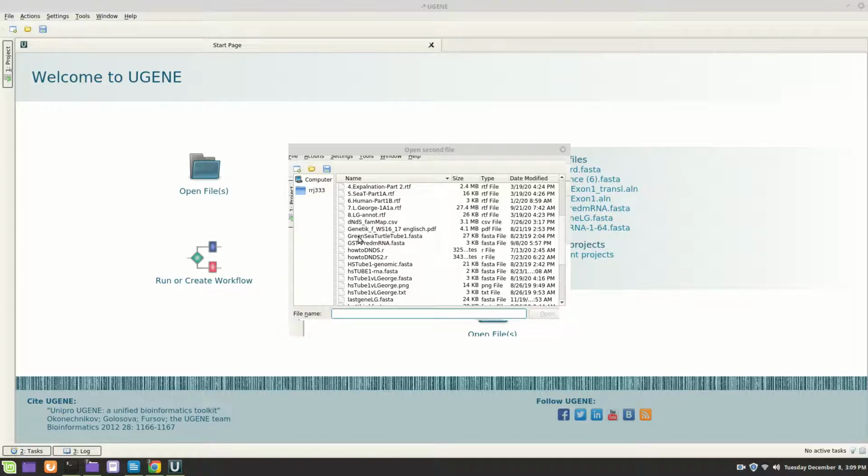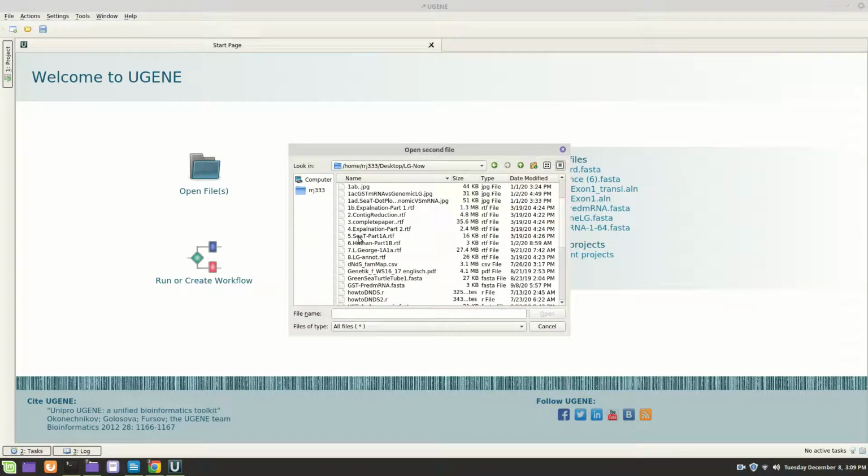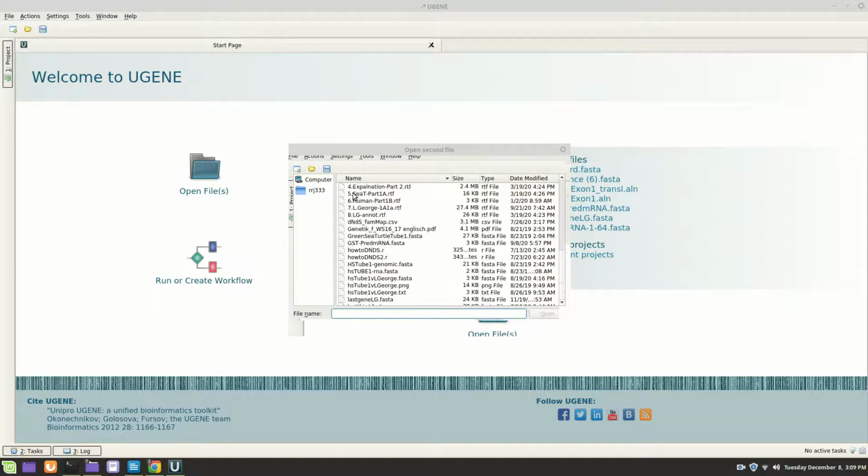Oh, I have it already, and I'd already downloaded it. Let's get the one that I told you though. I've of course done this several times here. Which one did I give you? It was called... I did it with humans too, just to see what it looked like.